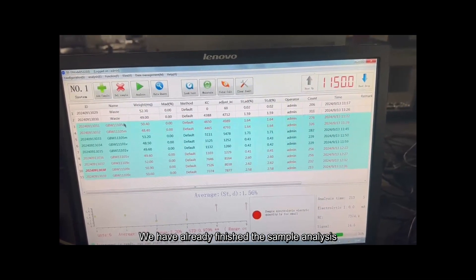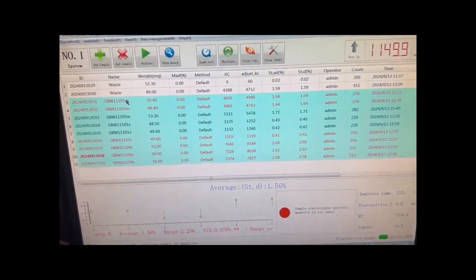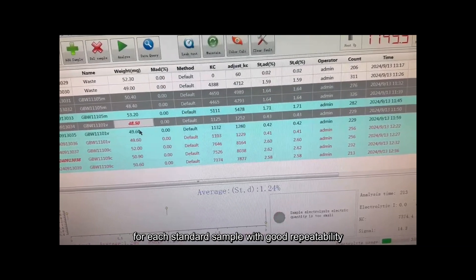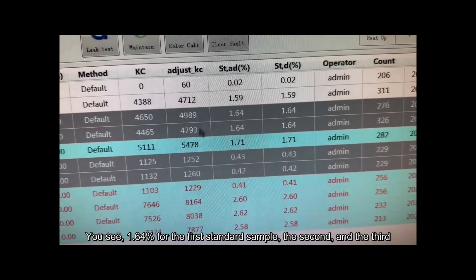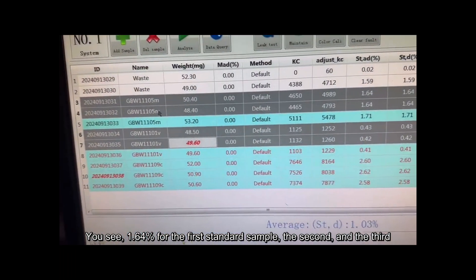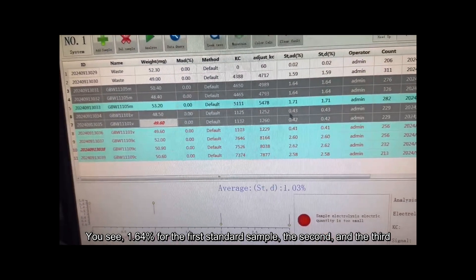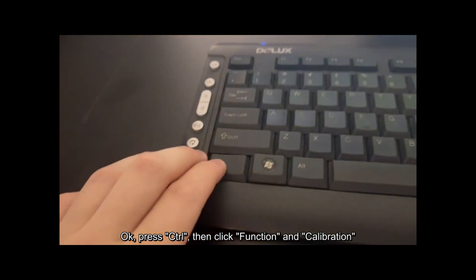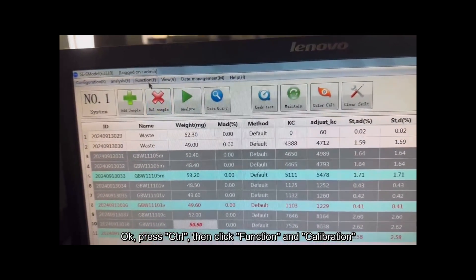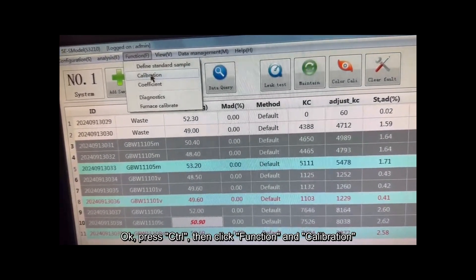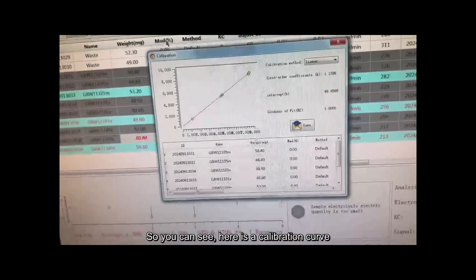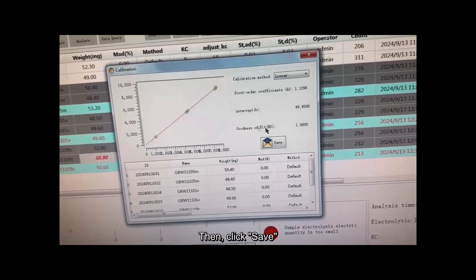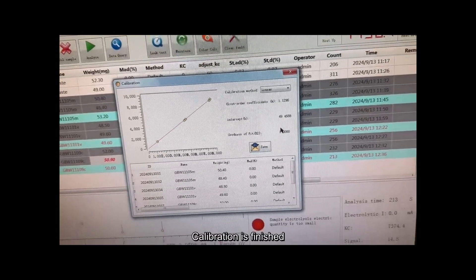Now we have already finished the sample analysis. We are going to select the sample analysis results — for each standard, check for good repeatability. For example, the first standard sample shows 1.64. Press Ctrl on the keyboard, then click Function, click Select Calibration — you can see the calibration curve. Click Save. Calibration is finished.